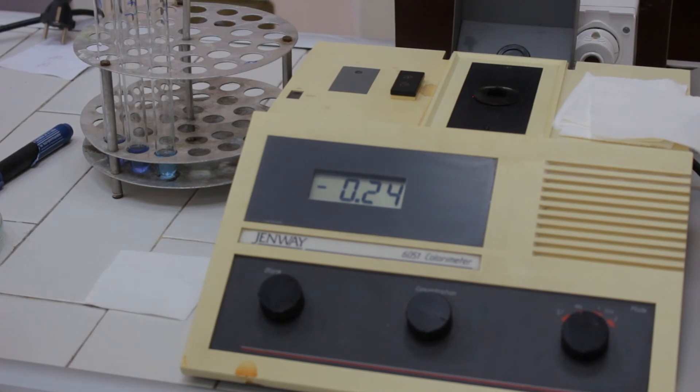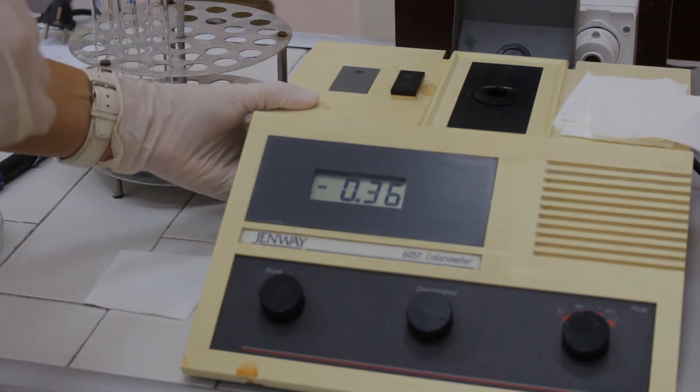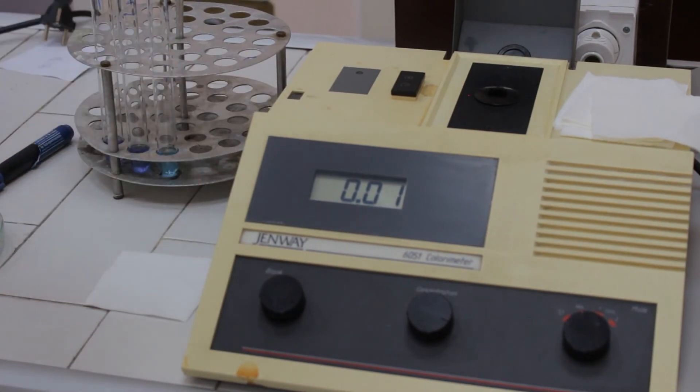After 30 minutes, we may approach to read the absorbances at a working wavelength of 540 nanometers. Then we have to adjust the instrument to zero with the blank solution.